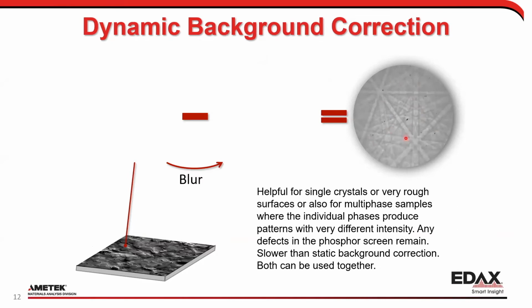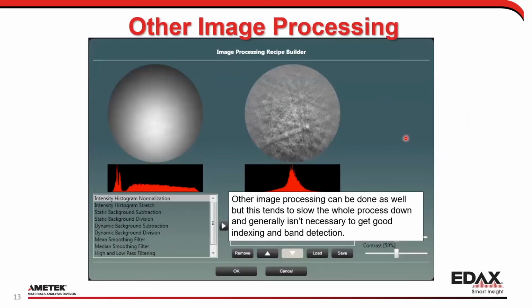And you actually can stack these backgrounds on top of each other. There's a whole bunch of things you can do with the image processing of these patterns. You can spend days trying to figure out this kind of stuff if you really wanted to say, okay, I want a very, very specific background for what I'm doing. Overall, with this image processing, you don't want to go too crazy on it, but you can go crazy if you want to. There are plenty of options for this kind of thing.